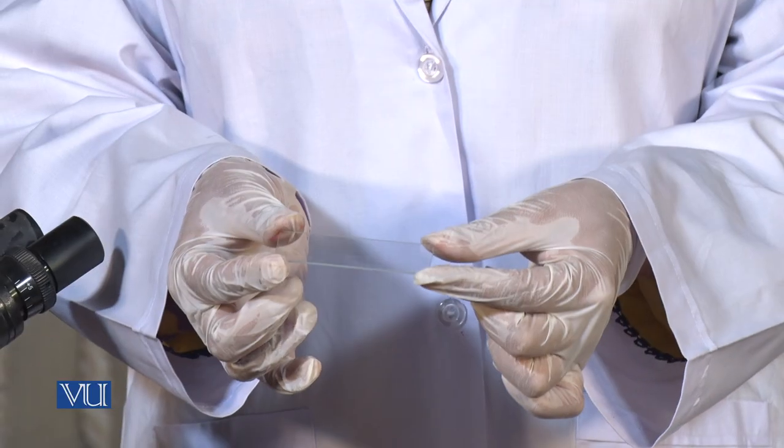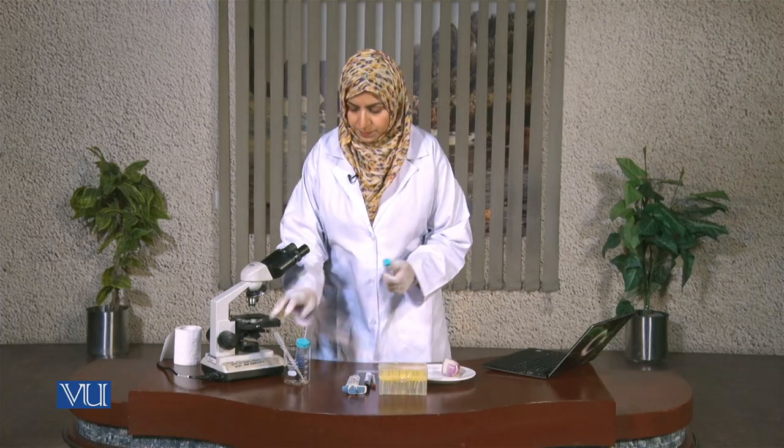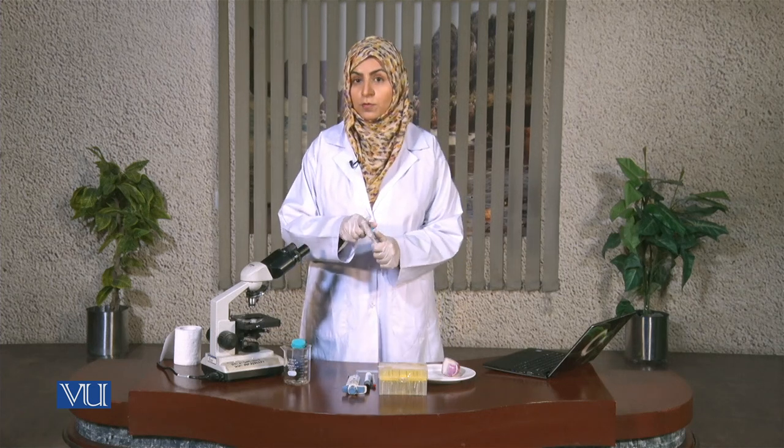Now let's start with the procedure. First, we will take a clean glass slide and place a drop of water on it.